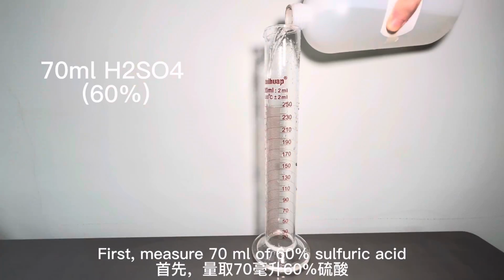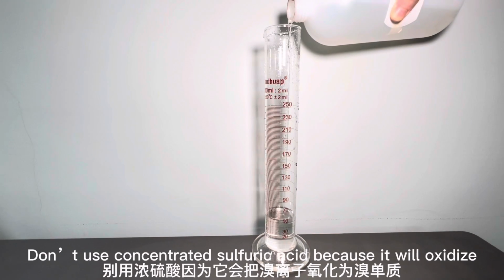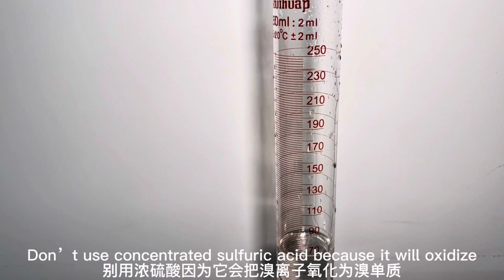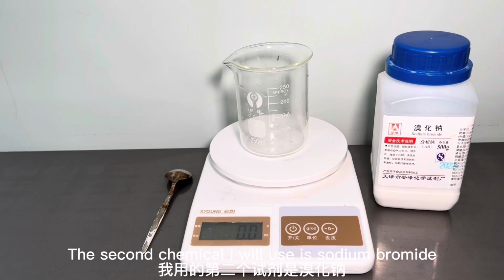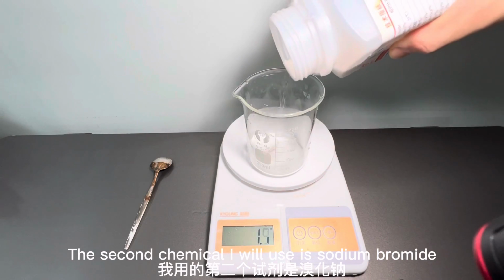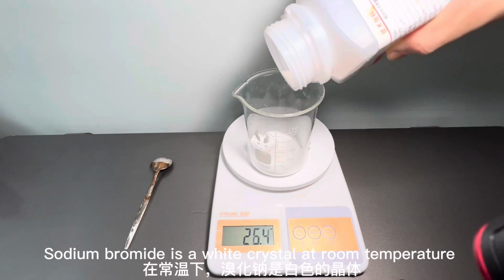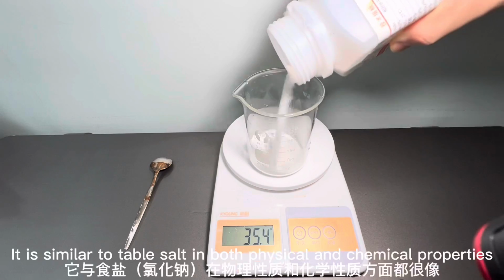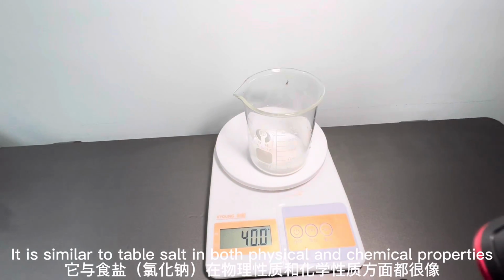First, measure 70 ml of 60% sulfuric acid. Don't use concentrated sulfuric acid because it will oxidize bromide into bromine. The second chemical I will use is sodium bromide. Weigh about 40 grams of sodium bromide. Sodium bromide is a white crystal at room temperature. It is similar to table salt in both physical and chemical properties.